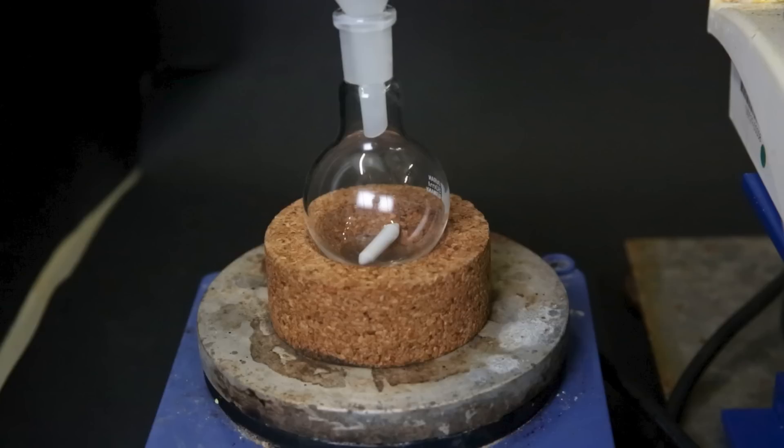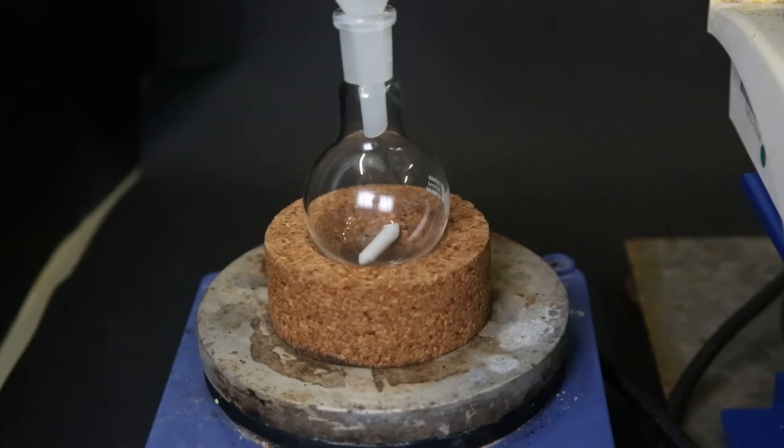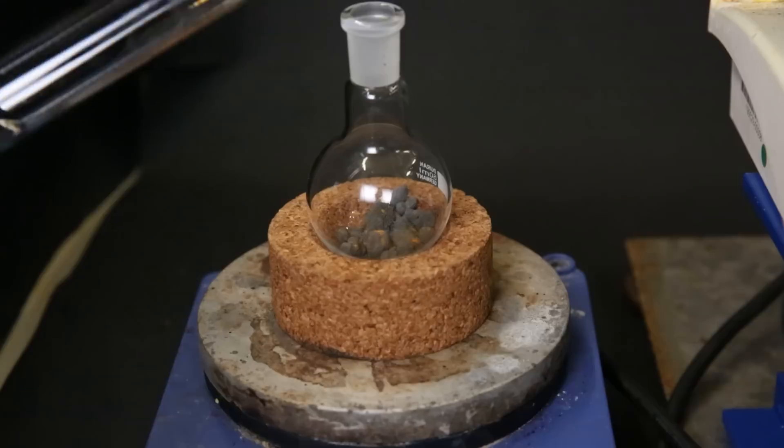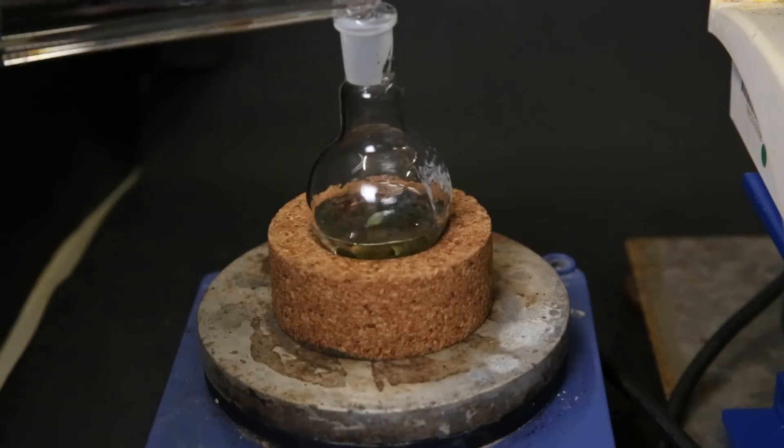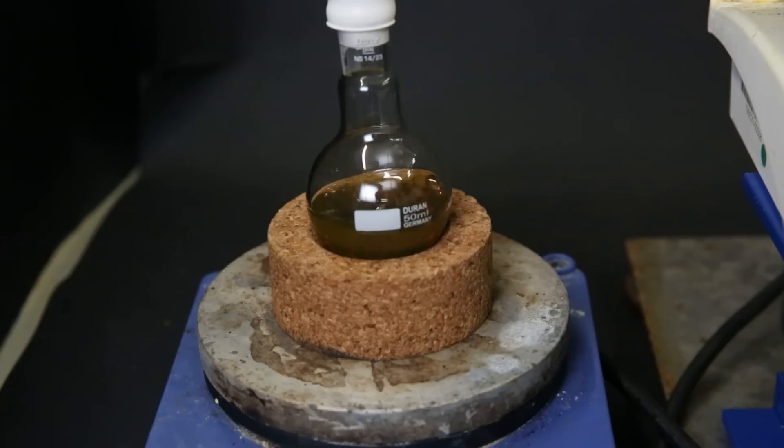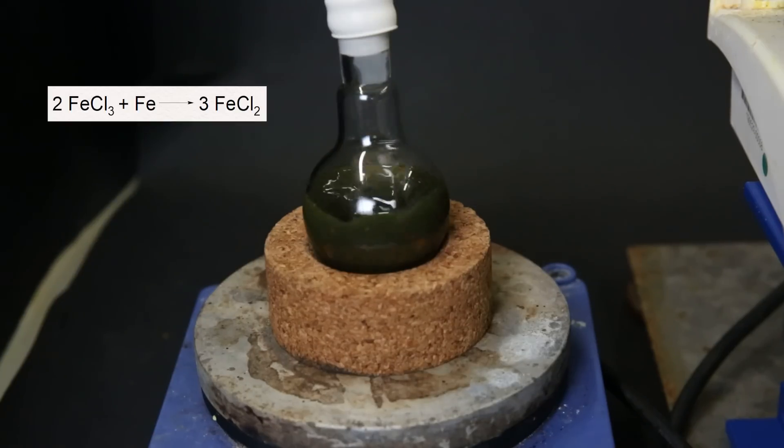So to make ferrocene, I need iron(II) chloride, but iron(II) chloride is quite unstable and oxidizes in air to iron(III) chloride. So to get around this, I will prepare iron(II) chloride in situ by mixing it with iron powder. So I add a mixture of iron powder and iron(III) chloride hexahydrate to a flask, and add 20 milliliters of degassed DMSO. While stirring, the iron(III) chloride will get reduced to iron(II) chloride, and the iron will also form iron(II) chloride, according to the reaction shown.